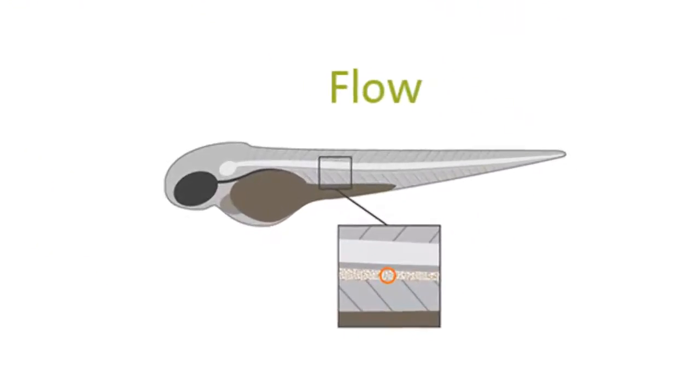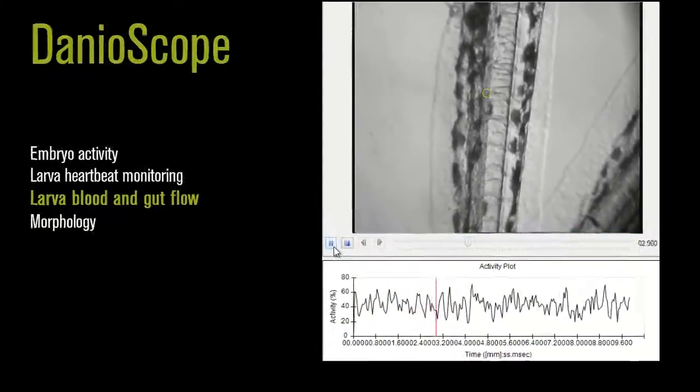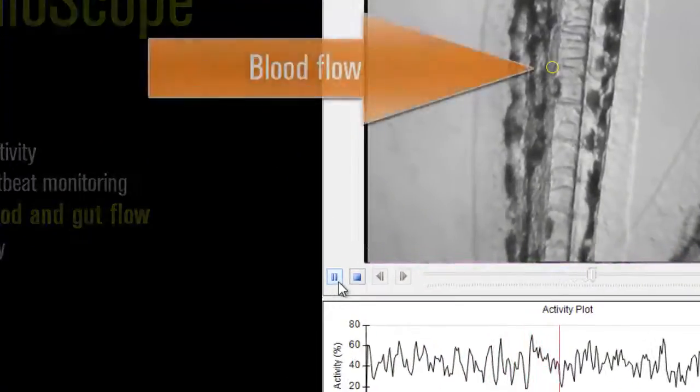Let's move on to blood flow and gut flow. Flow is measured by defining a circular area in the diameter of the vein or elsewhere.